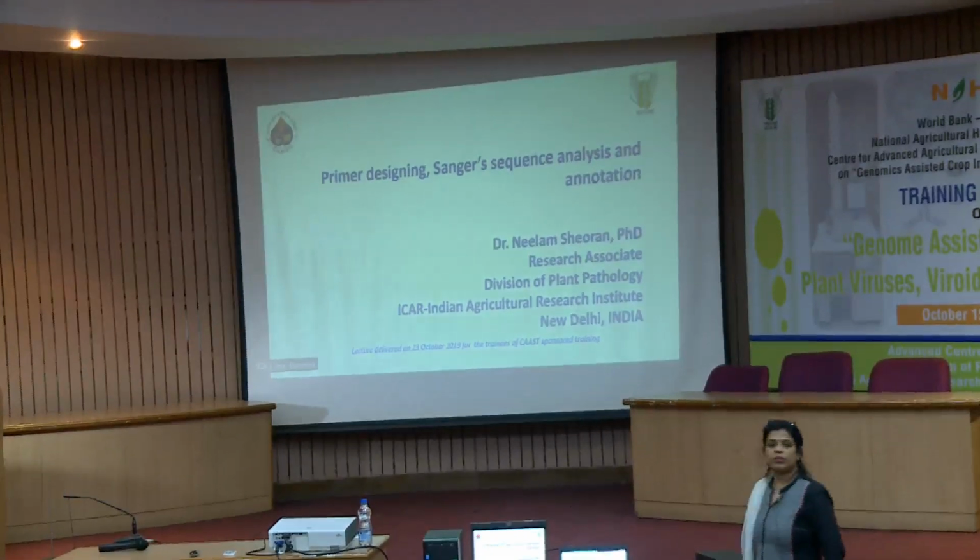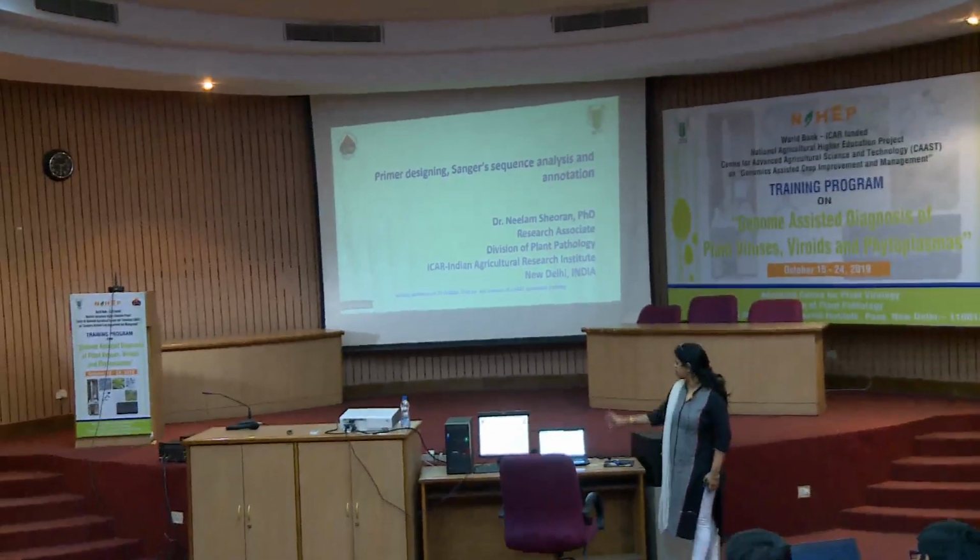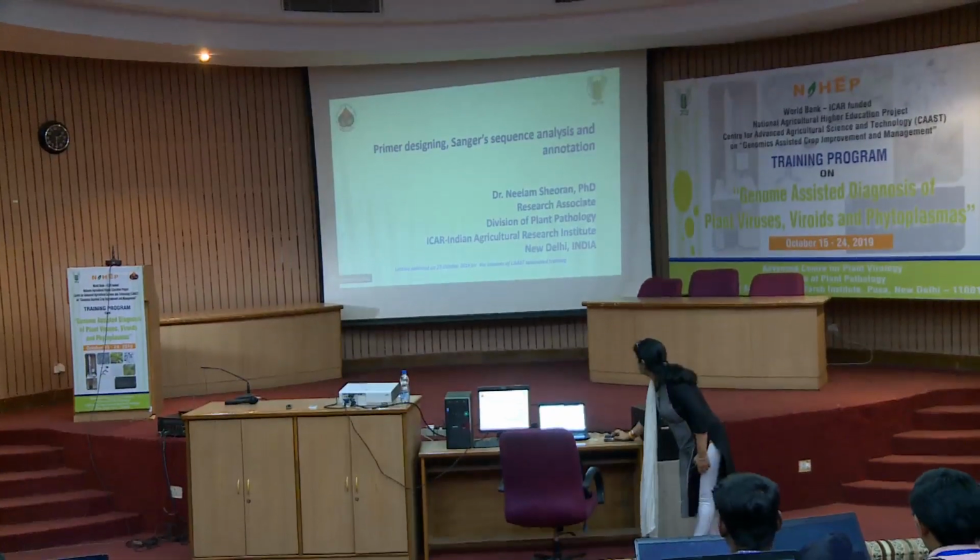So when you Google Primer 3 Plus, this is the first window that will come.